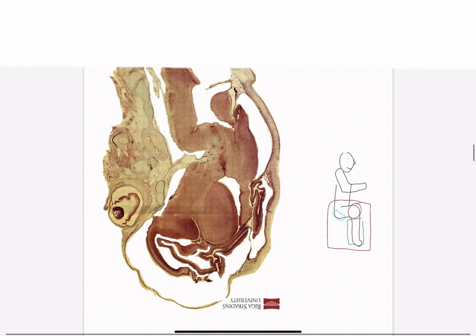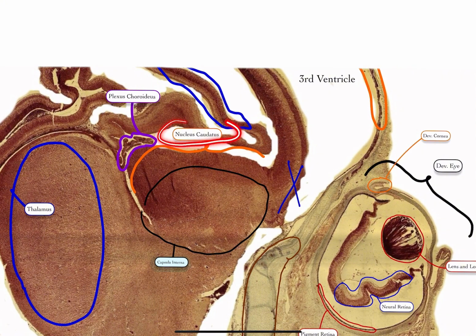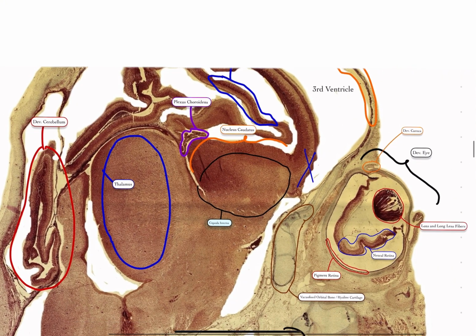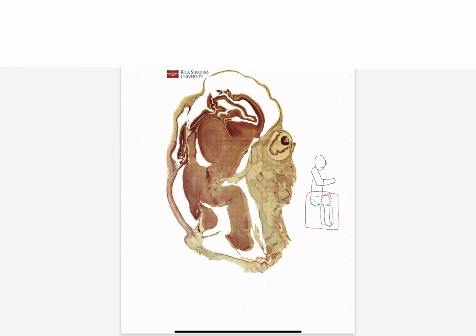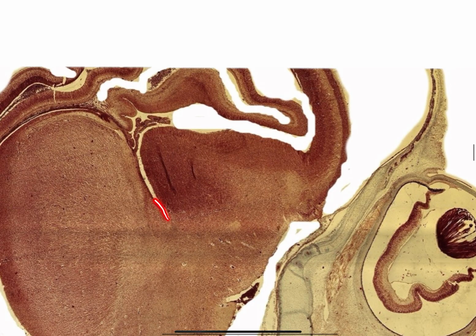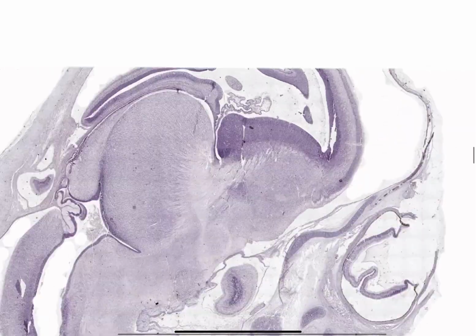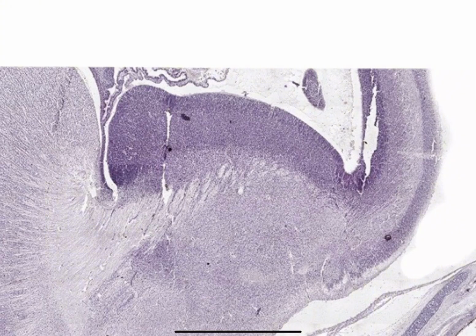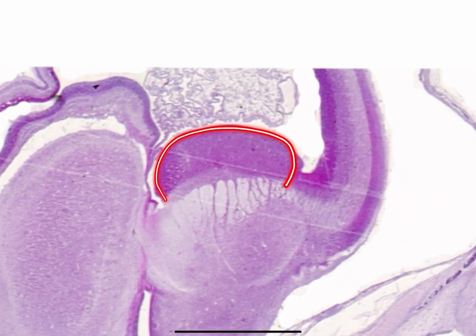Now let's continue on with the next structure. The second structure I'd like to talk about is the nucleus caudatus, and it appears like this. It's very close to the general eye area, and if we look at it with no annotations, it appears almost like the head of a mushroom, almost like a papilla of the tongue, right? Protruding out like this. And usually the nucleus caudatus has additional structures that I would like to call migrating neuroblasts. The best way I could describe this, here we go, this would be the nucleus caudatus, and then we have the migrating neuroblasts right there.